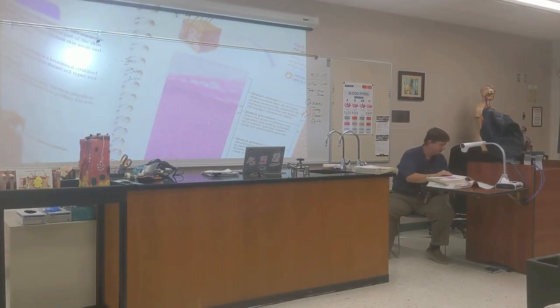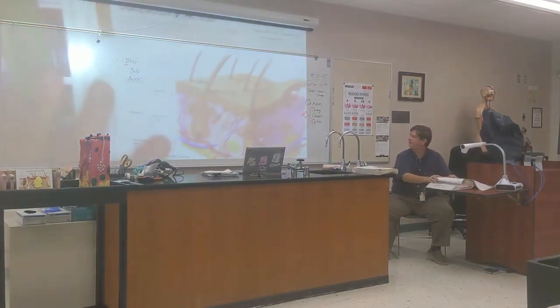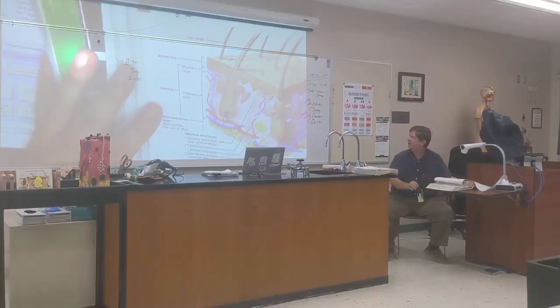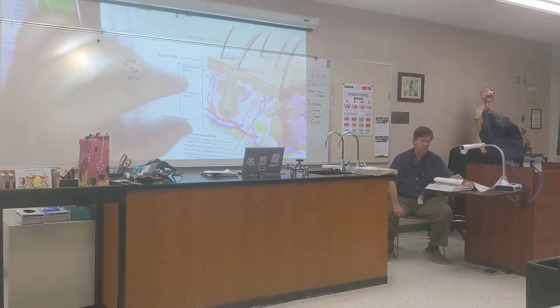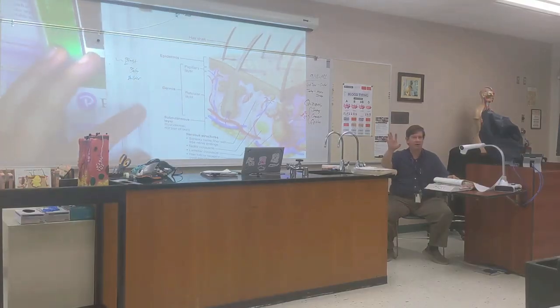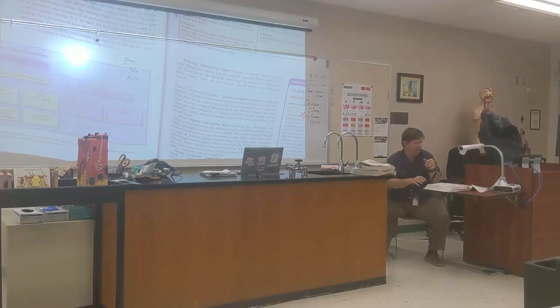All right, so here, yeah, this is a much prettier picture. Check this out. So the papillary layer is that little part at the top of the dermis where the dermal papilla is, yes? And then most of the dermis is the reticular layer. Are we clear? All right, now let's go back to what we were just looking at in histology and what they said.